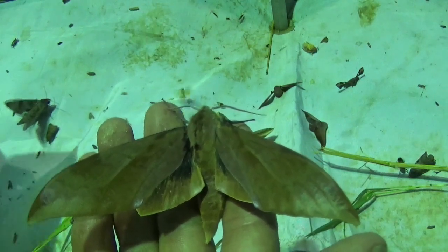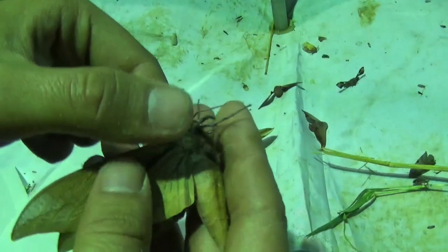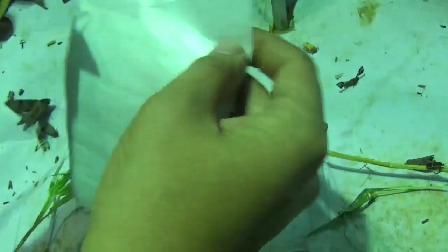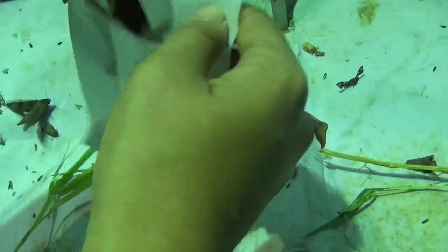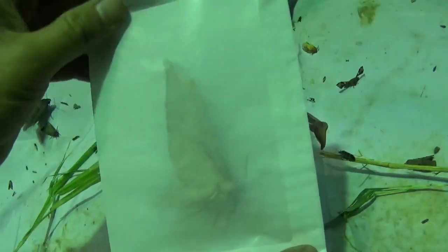Last but not least, if you want to keep your specimen fresh, it is important to store it properly. For this we use these special entomological papillots — papers. Insert the insect here, and you can store the specimen like this.